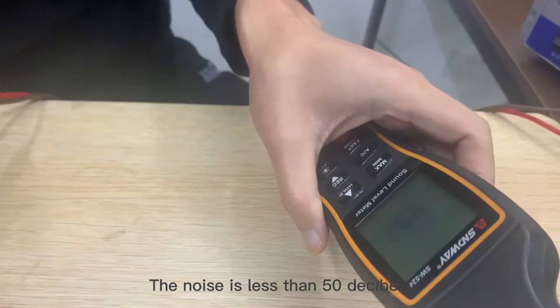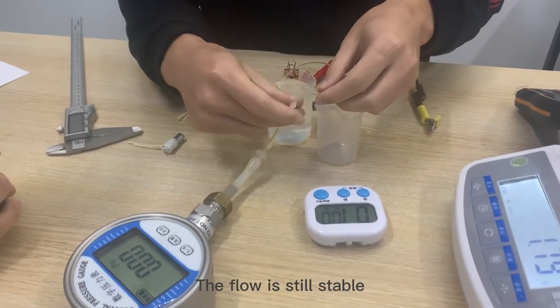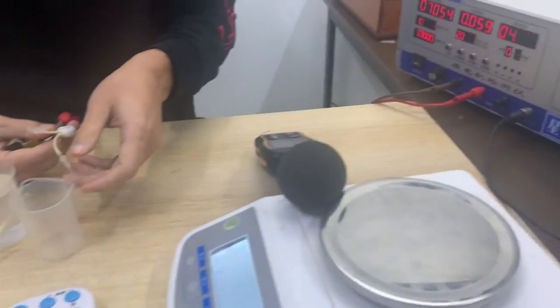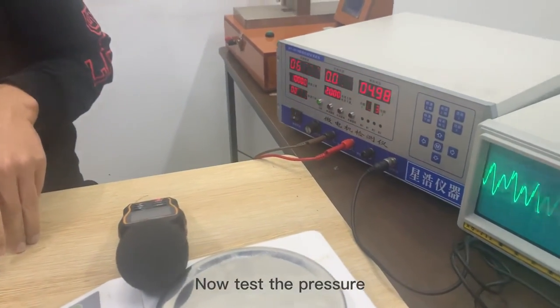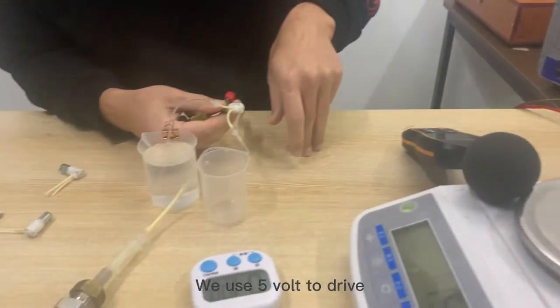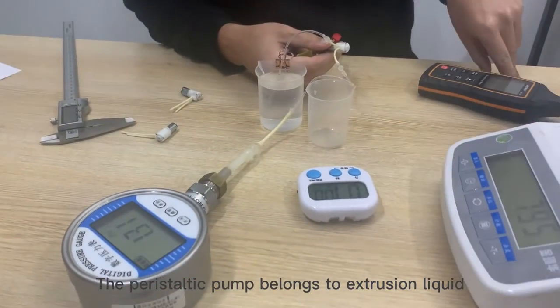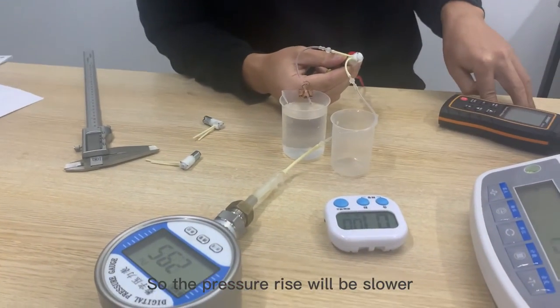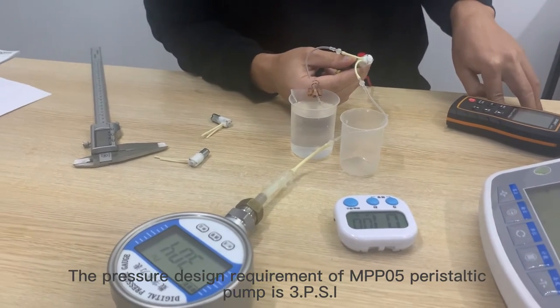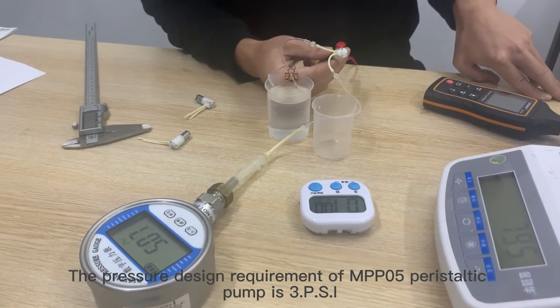Now test the pressure. We use 5V to drive. Peristaltic pump belongs to extrusion liquid, so the pressure is rising slowly. Water pressure standard for MPP05 is over 3 pounds per square inch. The actual pressure test is more than 5 pounds per square inch.